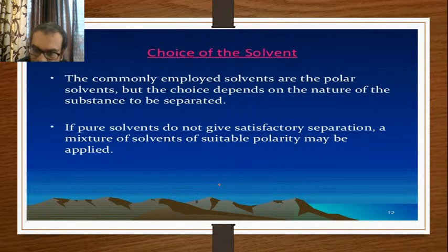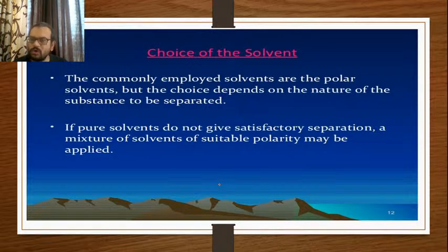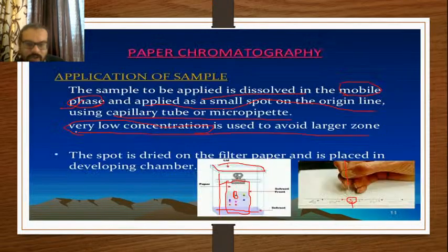Pure solvents do not give satisfactory separation. A mixture of solvents of suitable polarity may be used. If you use a pure solvent, maybe methanol, water or acetone, and you are not satisfied with the separation, you can go for a mixture of solvents. You just need to maintain the proper ratio for the developing chamber.